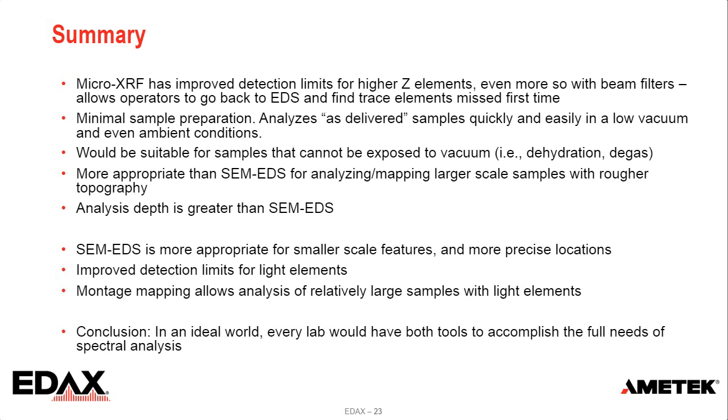The interaction of electrons and anode materials in the X-ray tube does generate a bremsstrahlung background, and it will show up in the sample spectrum. As well as tube X-ray lines. Those are the artifacts. Like if you use a rhodium tube, you will see the rhodium L lines at around 2.7 keV and the rhodium K line at around 20 keV.